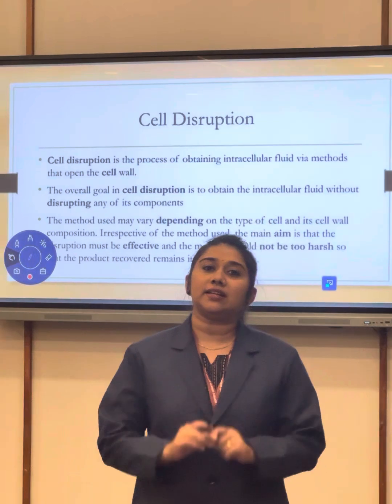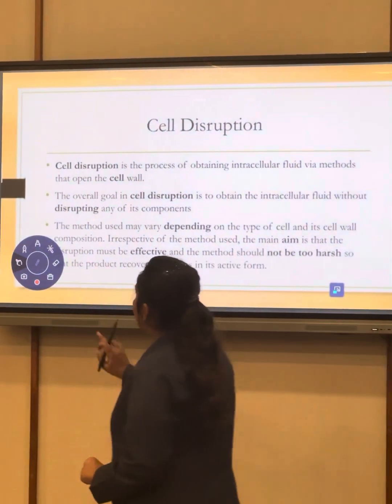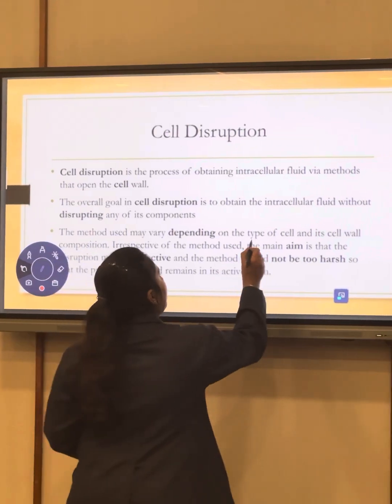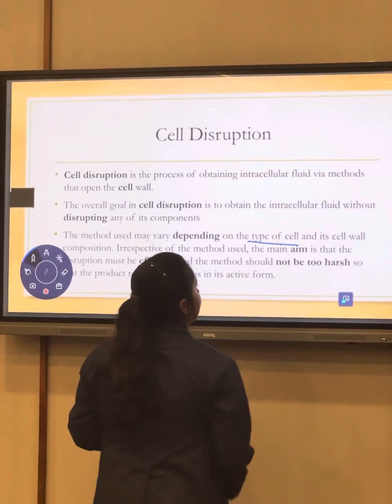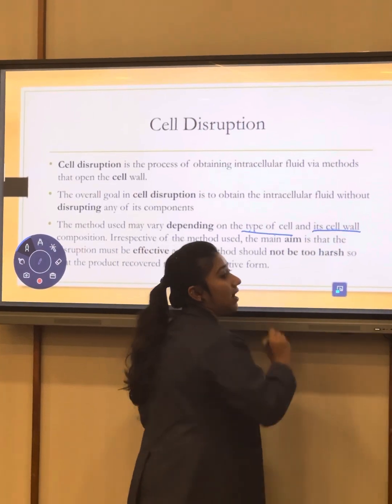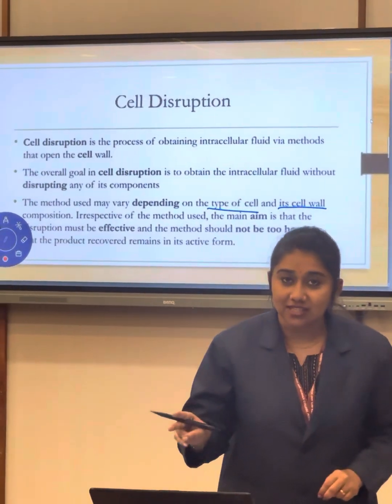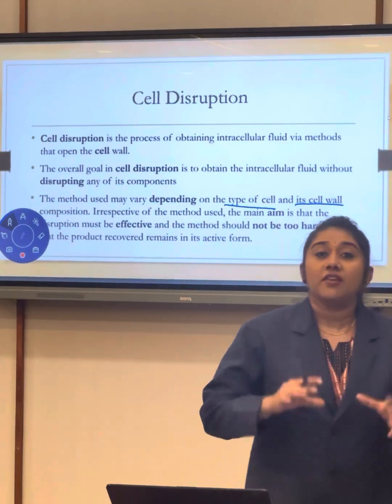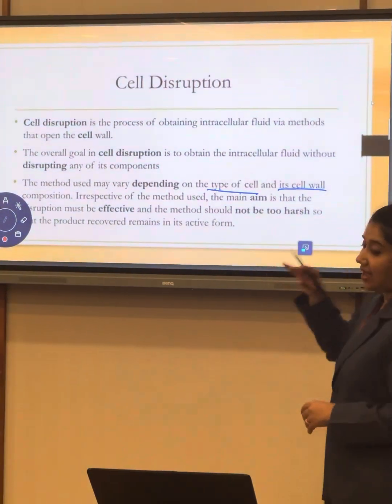So this method is based upon two factors, that is the type of the cell and its cell wall. Based upon the cell wall and type of the cells, we are breaking the cells. Okay, moving on to the next slide.